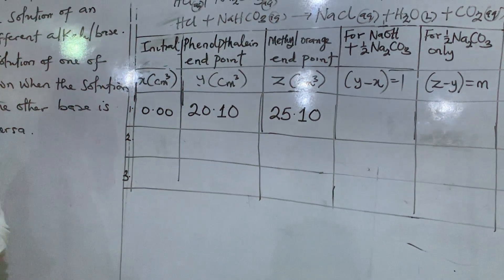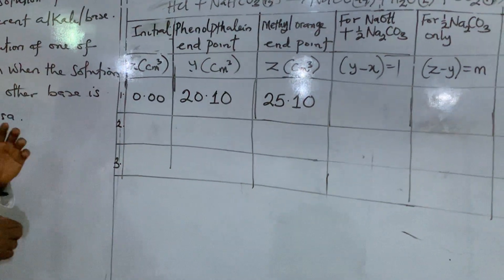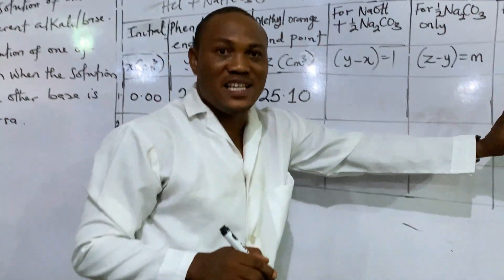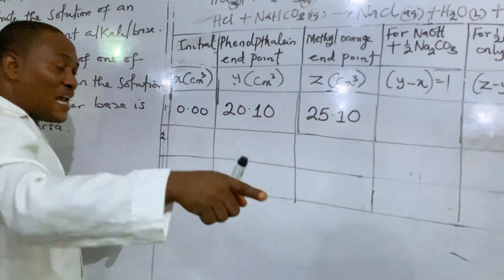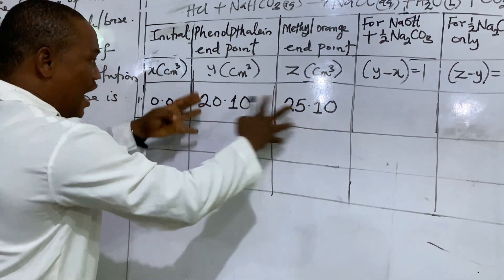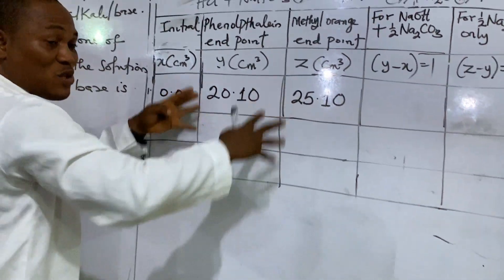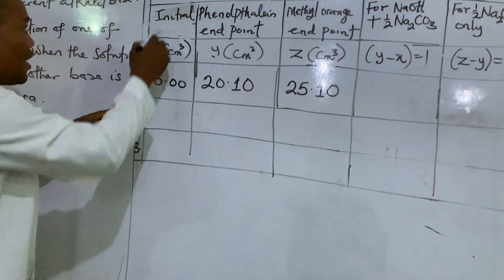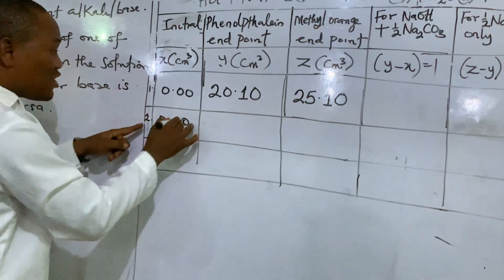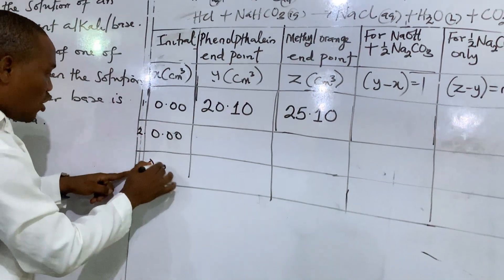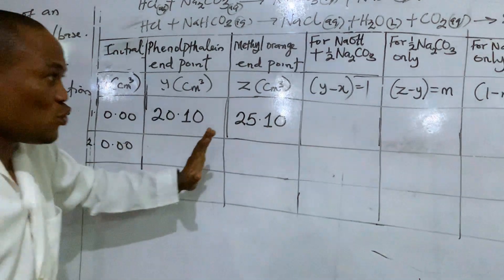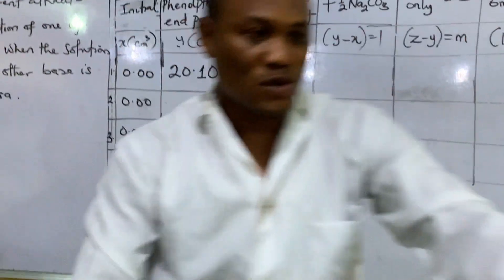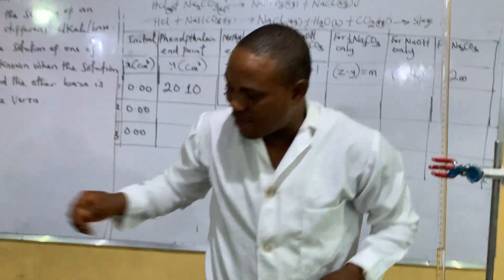I don't know if somebody is still getting this. Okay, so we'll finish all this. I'll explain — let's do the second titration. Let me refill. Because you know, I'm having a double indicator, so I don't want to start from there. I will refill, so let me make all my initial readings to be zero. Let me do the third one too so that you can see. So let's get started again for the second one.